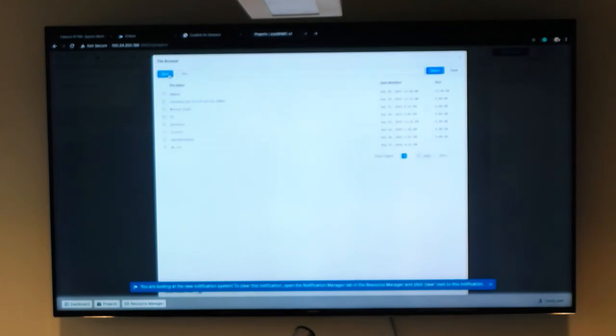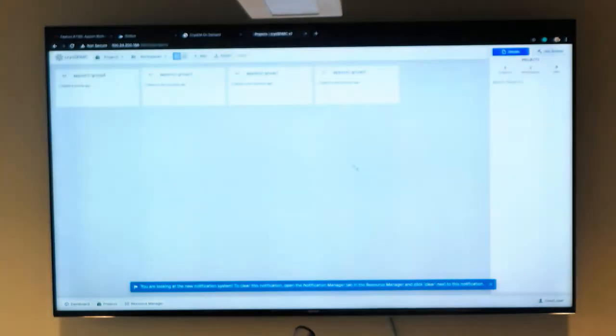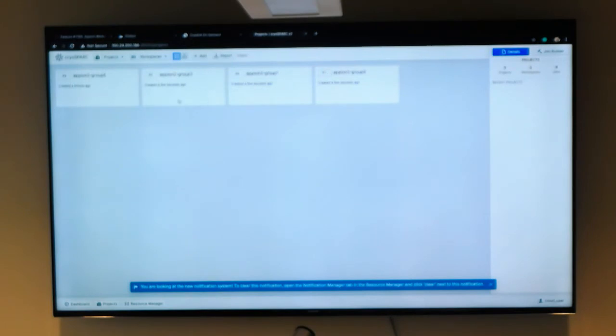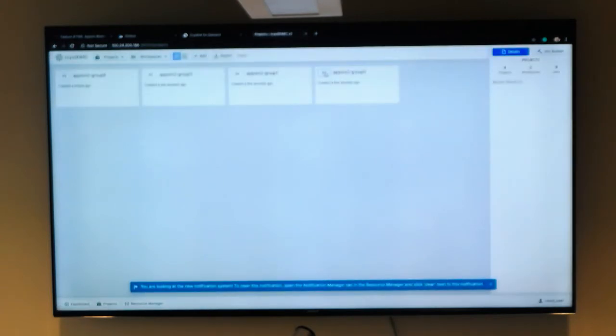You want to save that into our EFS projects. Something we'll have to do is be a little bit patient, because since we're all in the same web browser and using the same instance, as we're doing it we might override each other's paths. So for the first thing we do, let's see if we can get everyone to create a new project in EFS projects in the relative group. That's great, we have most of the groups going. But do be a little bit patient, we should have 5 groups. Is group 2 okay? There we go, everyone's there.